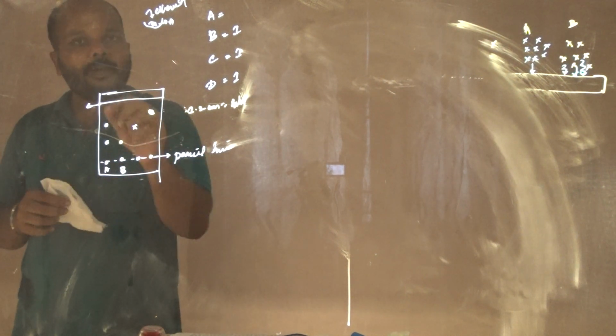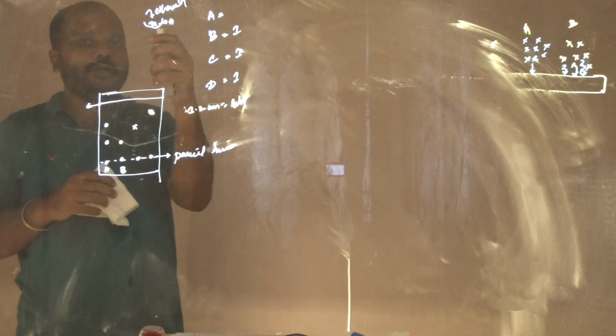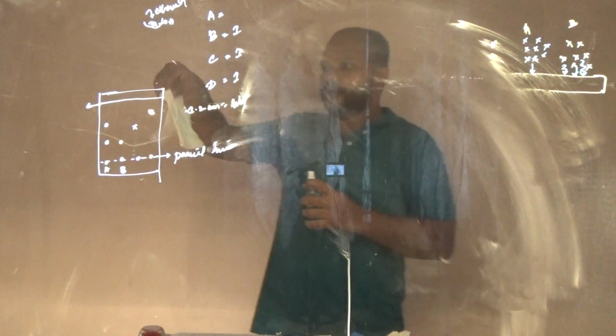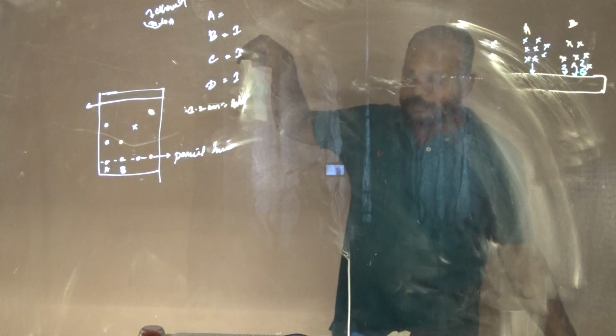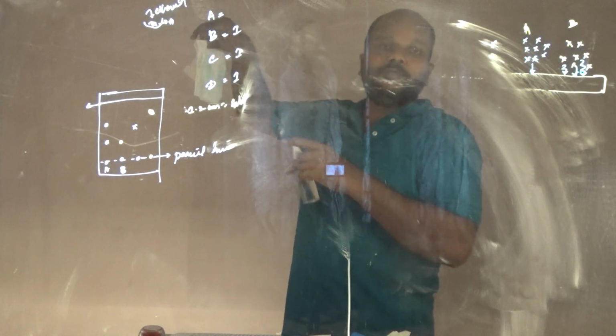So you take out the paper and spray it, the same way I have sprayed for cleaning this board. Suppose this is the chromatography paper. Not using the hand, of course, we will be spraying. Once we spray this coloring or visualizing agent, these spots will be visible.